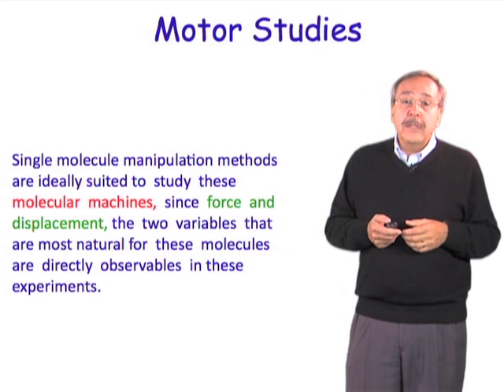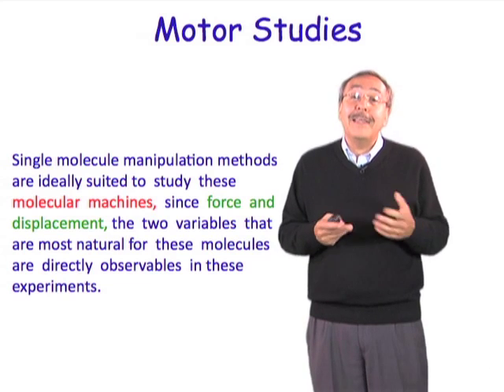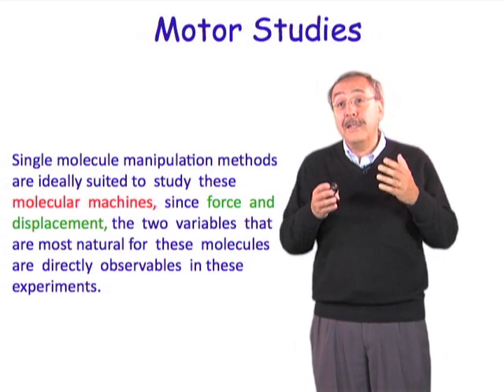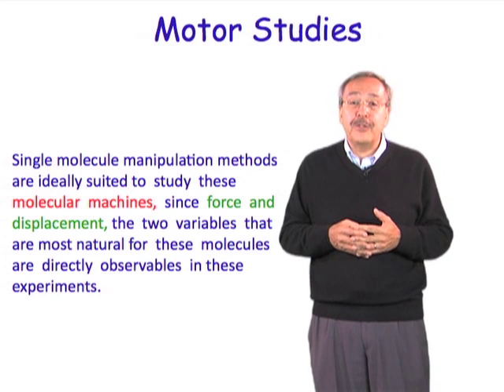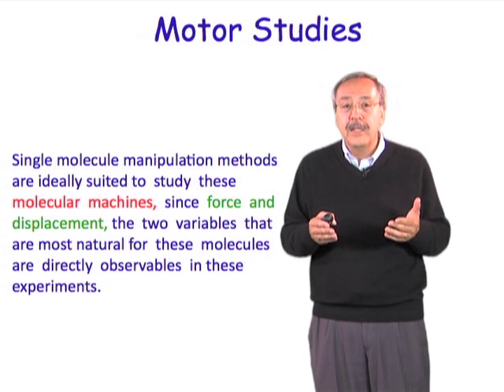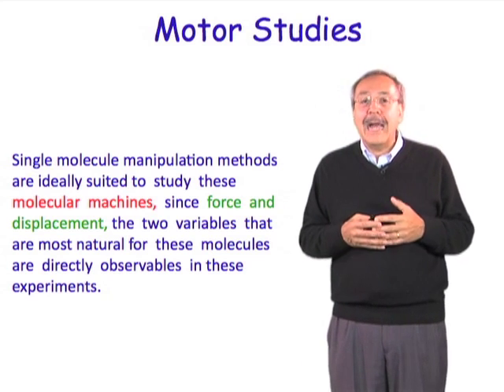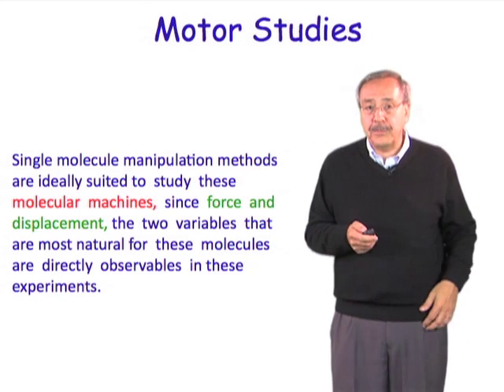Well, it turns out that single molecule manipulation methods, as I showed you before, are ideally suited to study these molecular machines, and particularly these molecular motors, because force and displacement, the two variables that are most natural for the behavior of these motors, are directly observable in single molecule manipulation experiments.